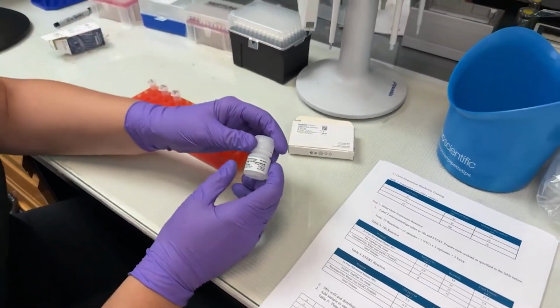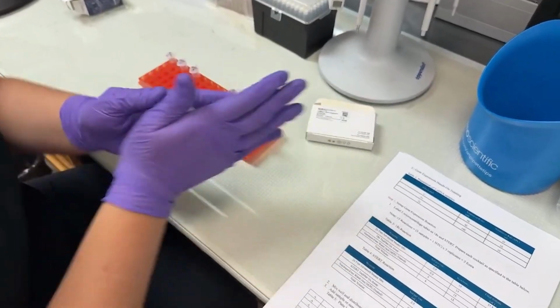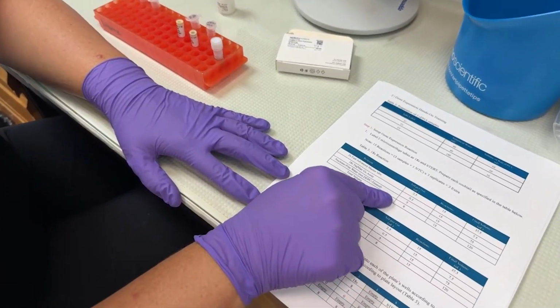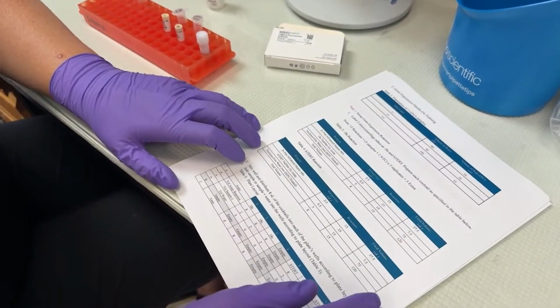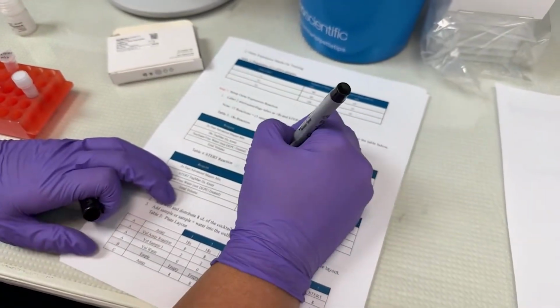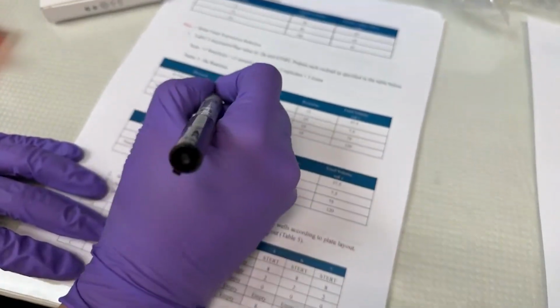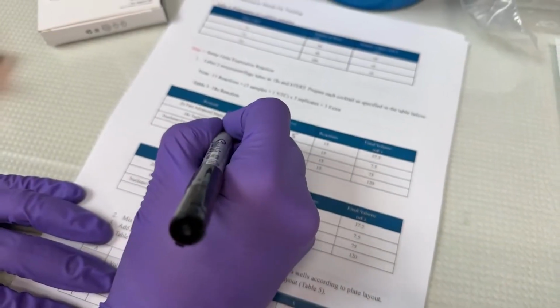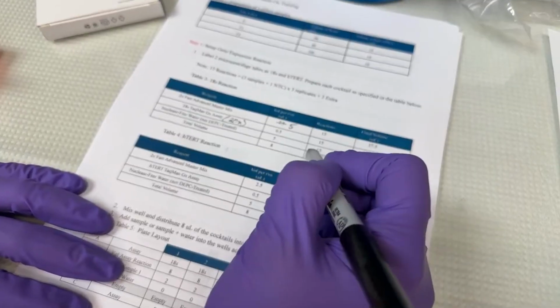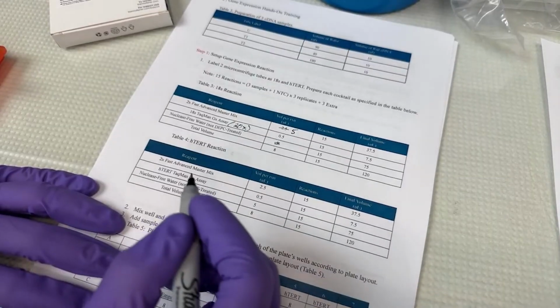First and foremost, we have that 2X Fast Advanced master mix. So here are the components for 1 reaction, which is going to be 2.5, is that right? That's not right. My math is wrong. We get to do this on the fly. Isn't that fun? So we have 5 microliters of our 2X master mix. This was originally at 20X for our assay composition, so there should be 0.5 microliters in each reaction. And then I have water that's going in. How much water? Good question.